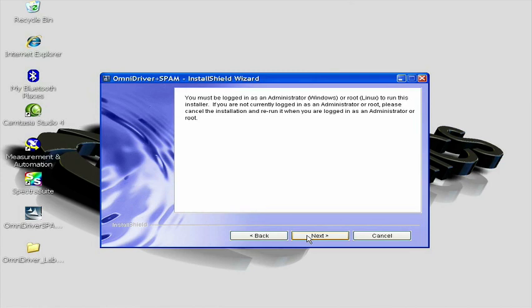The next screen alerts you that you must be logged in as an administrator or a root user in the case of Linux, in order to be able to properly install Omni Driver. Once you have verified that you meet this requirement, click Next.